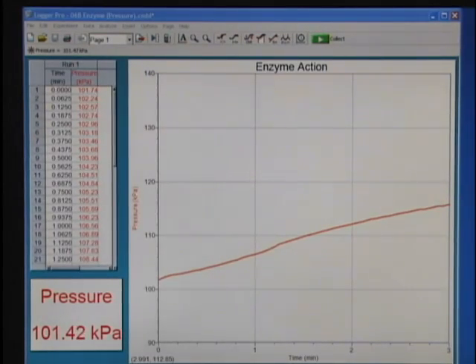When data collection is finished, take the stopper out of the top of test tube number one. In order to find the rate of oxygen production, we need to do a linear fit to the data that were collected.